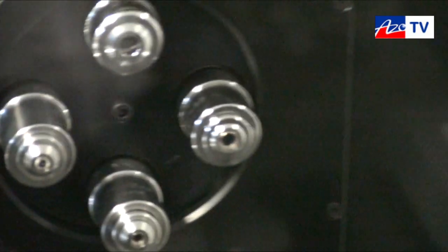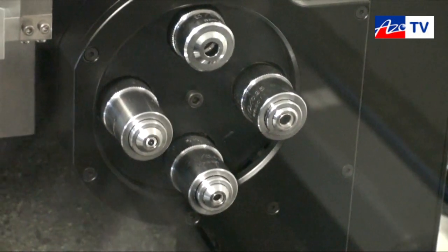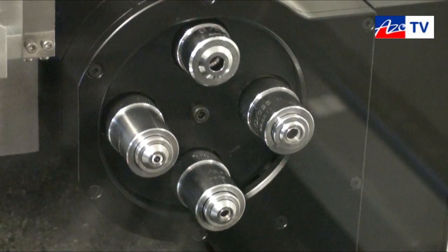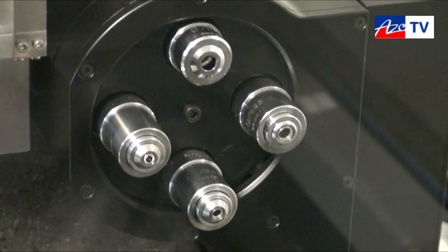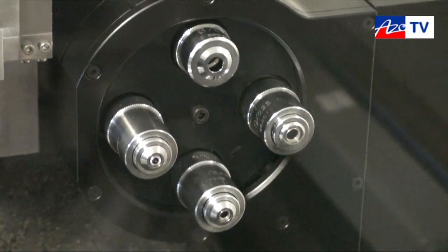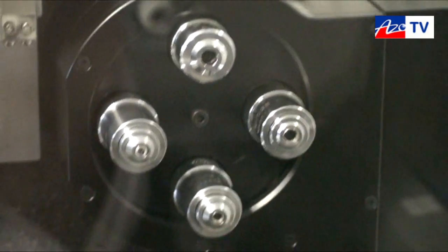And then the last measurement station is this multiple objective microscope where you can position your sample under a range of magnifications. Maximum magnification on that is above 3000. So even the very, very fine structures, you can line your sample up in front of the lens and then move automatically to the nano or micro measurement position.